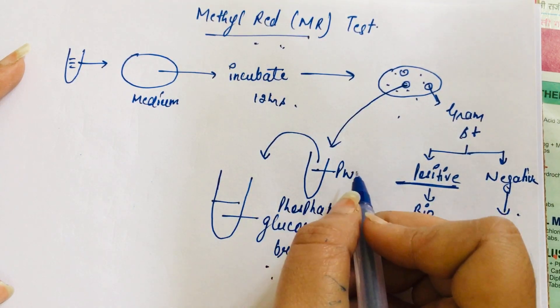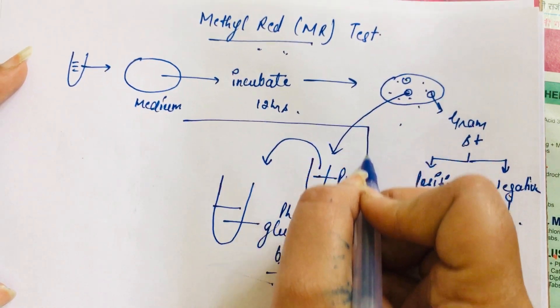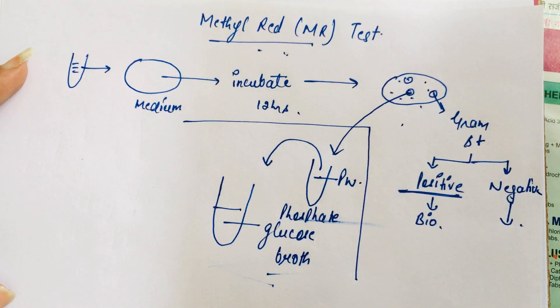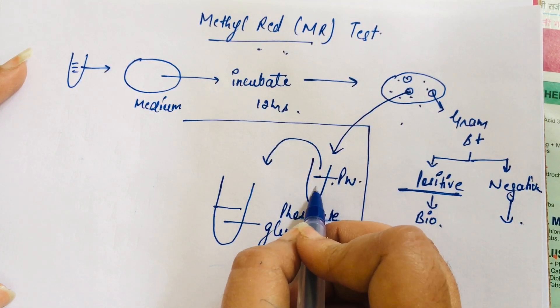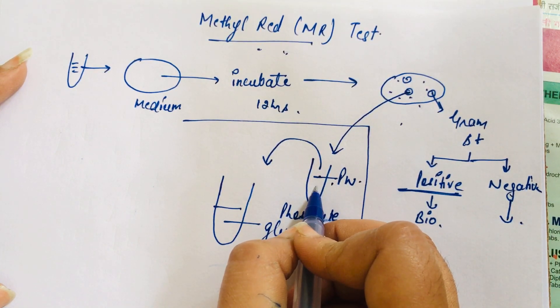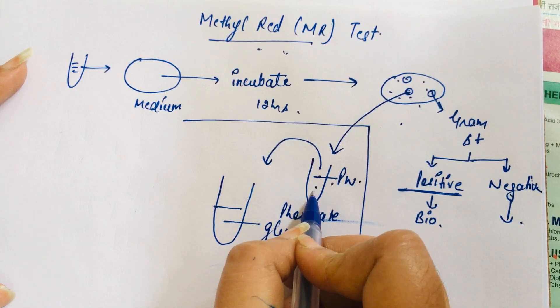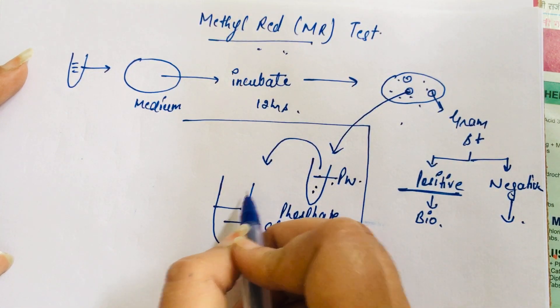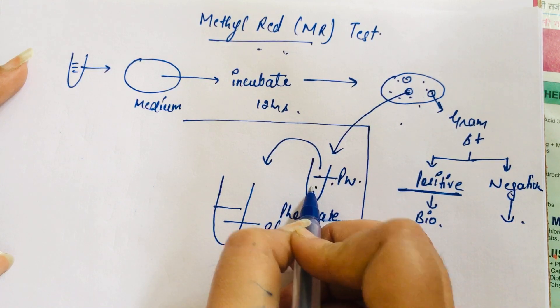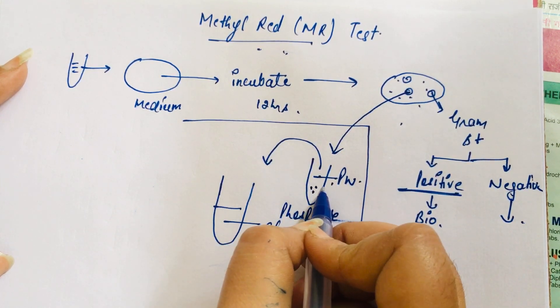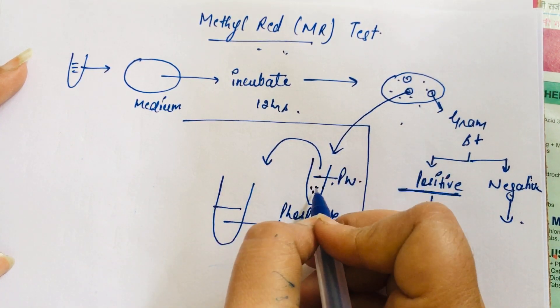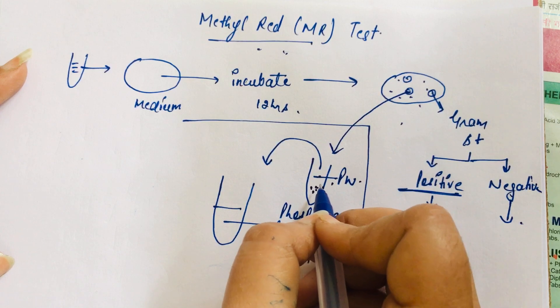The actual procedure of the biochemical reaction starts here. The previous steps are routine laboratory steps. We have peptone water into which we have already inoculated our colony — the organism we need to further diagnose. Now we take out that colony from the peptone water using an inoculating straight loop.